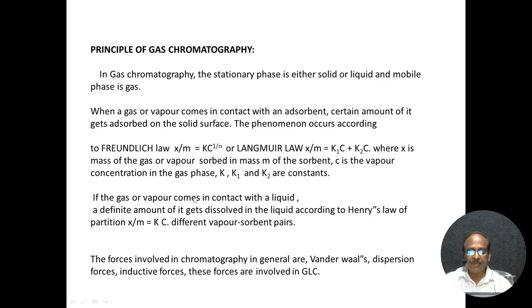If the gas or vapor comes into contact with a liquid, a definite amount gets dissolved in the liquid according to Henry's law, the partition x/m = K c. The different sorbents are there. In gas chromatography, the vapor is in contact.